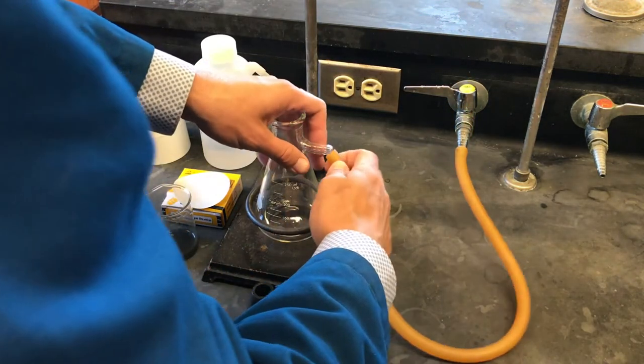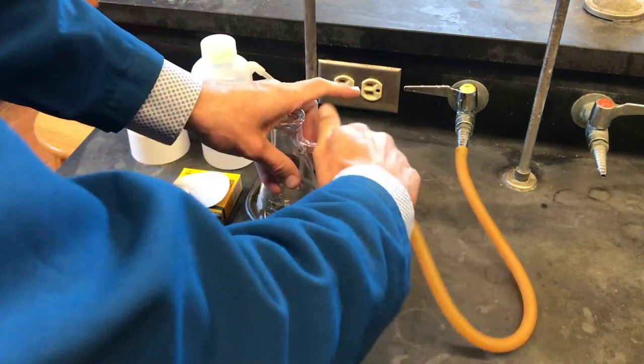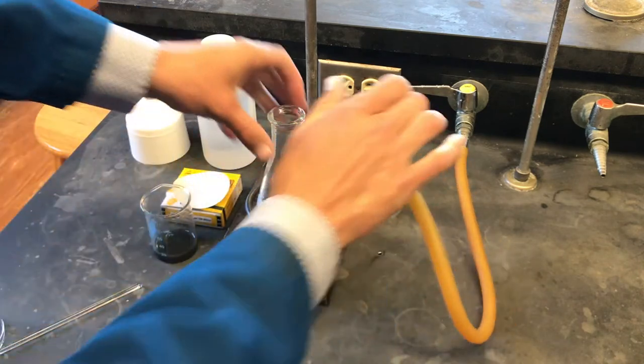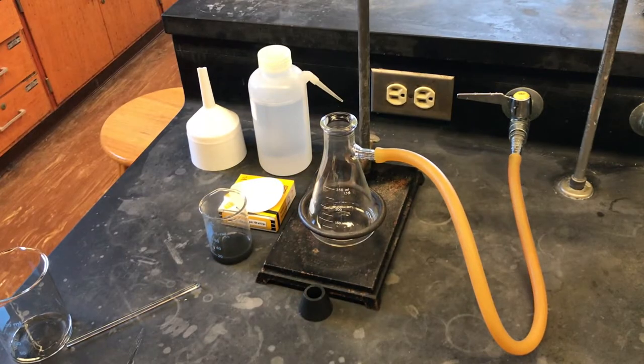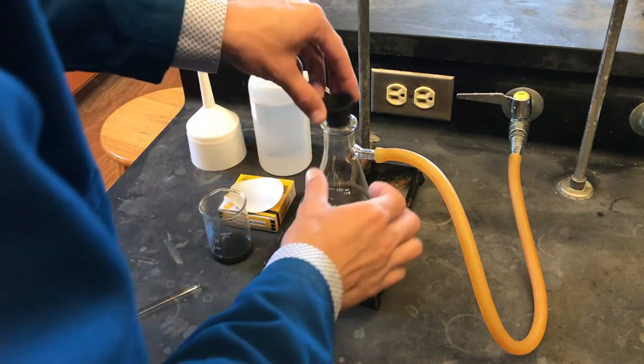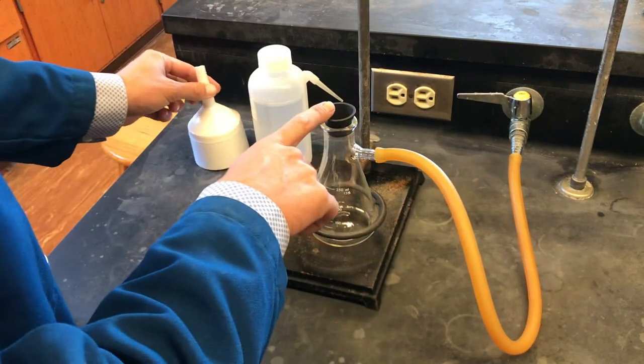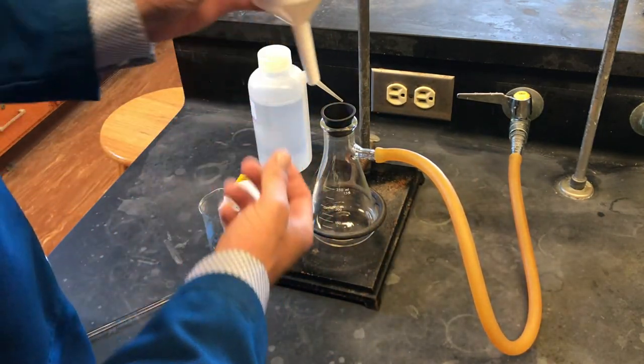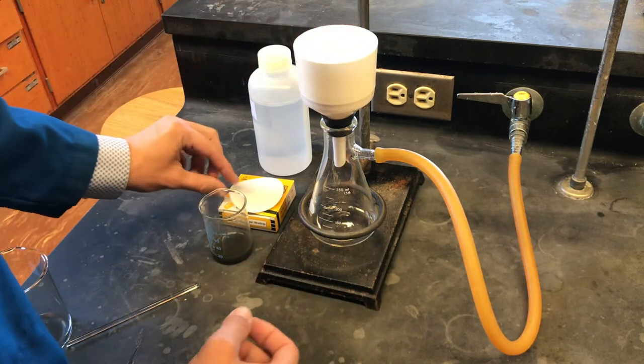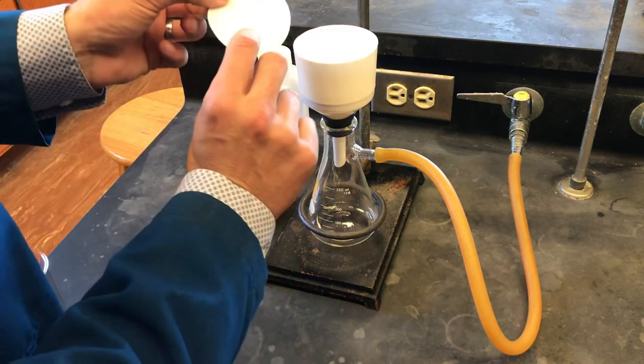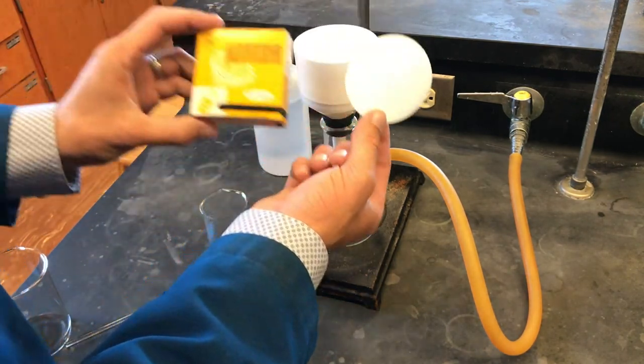A filter flask will be secured in a ringstand to eliminate risk of toppling during filtration. We'll then attach a vacuum hose from the house vacuum to our flask. The vacuum adapter goes next, which is a synthetic rubber gasket which ensures a good vacuum during filtration. On that goes the Buchner funnel, and in the funnel goes a piece of filter paper.